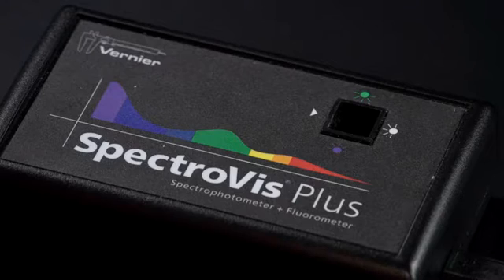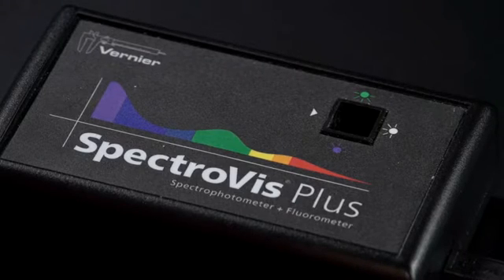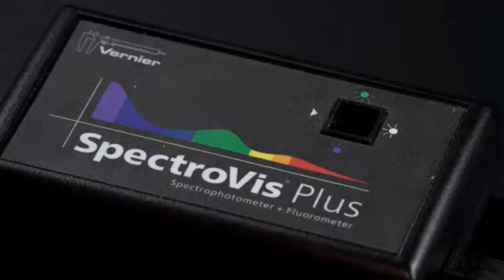We will be using a SpectraVis Plus spectrophotometer connected to a computer running Logger Pro software to begin our investigation.